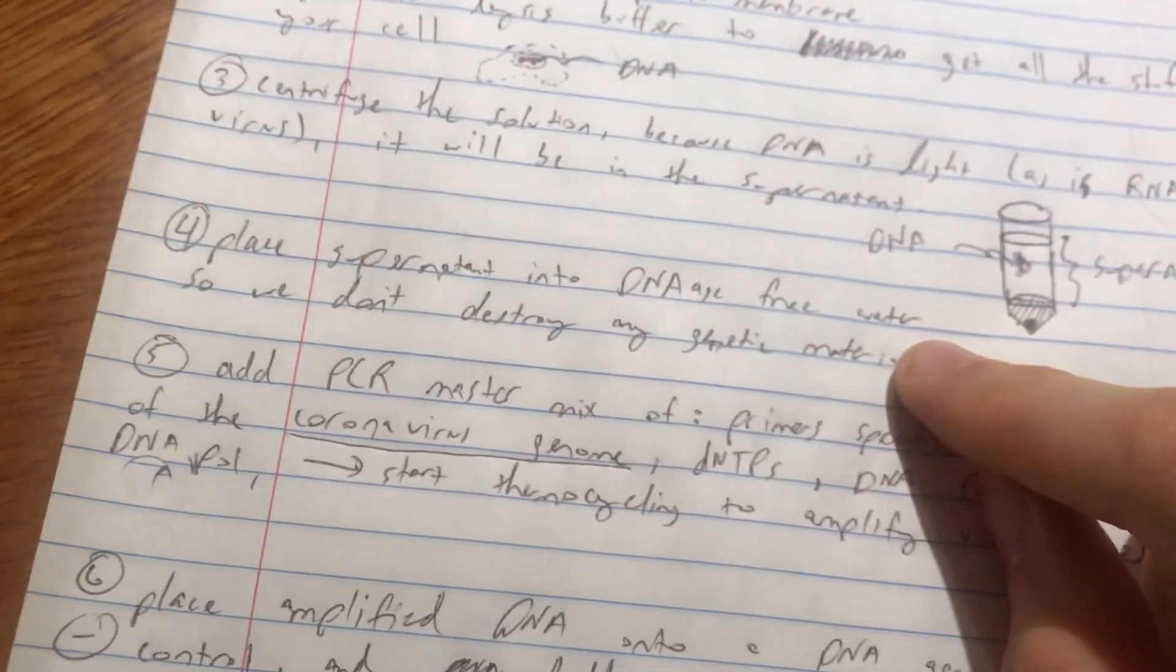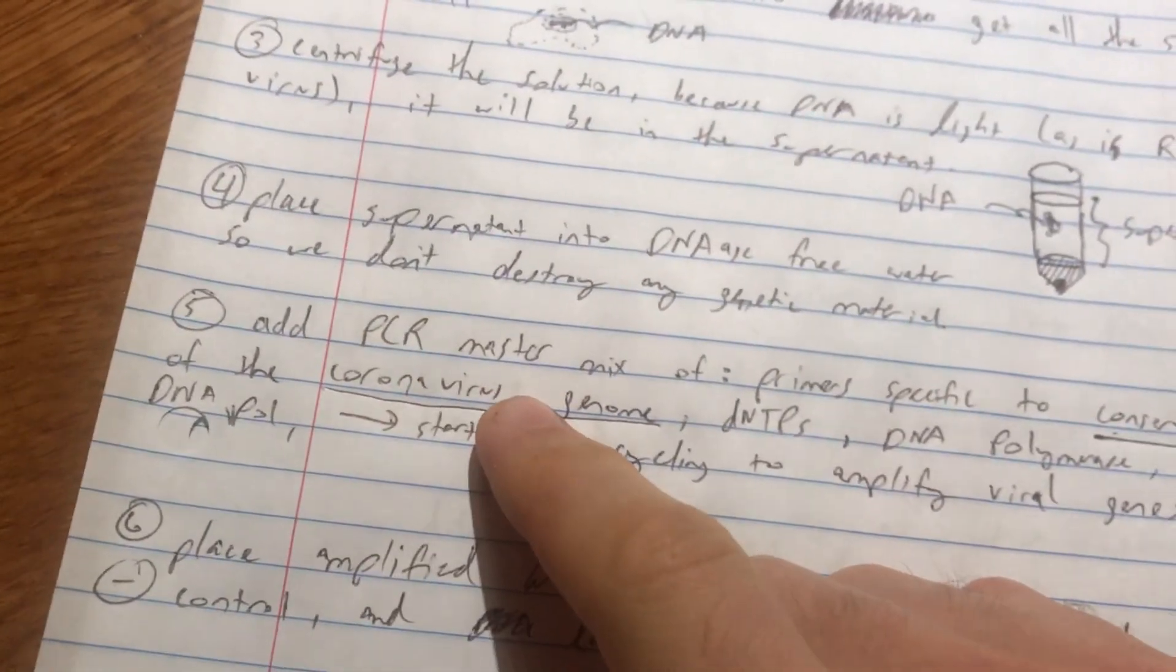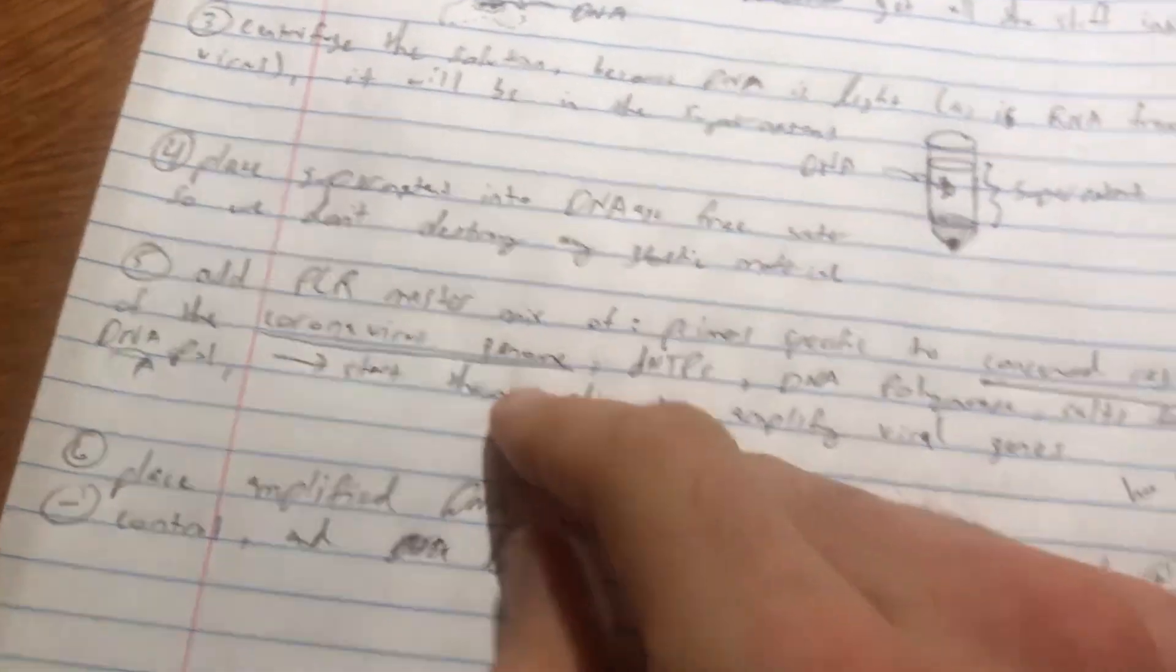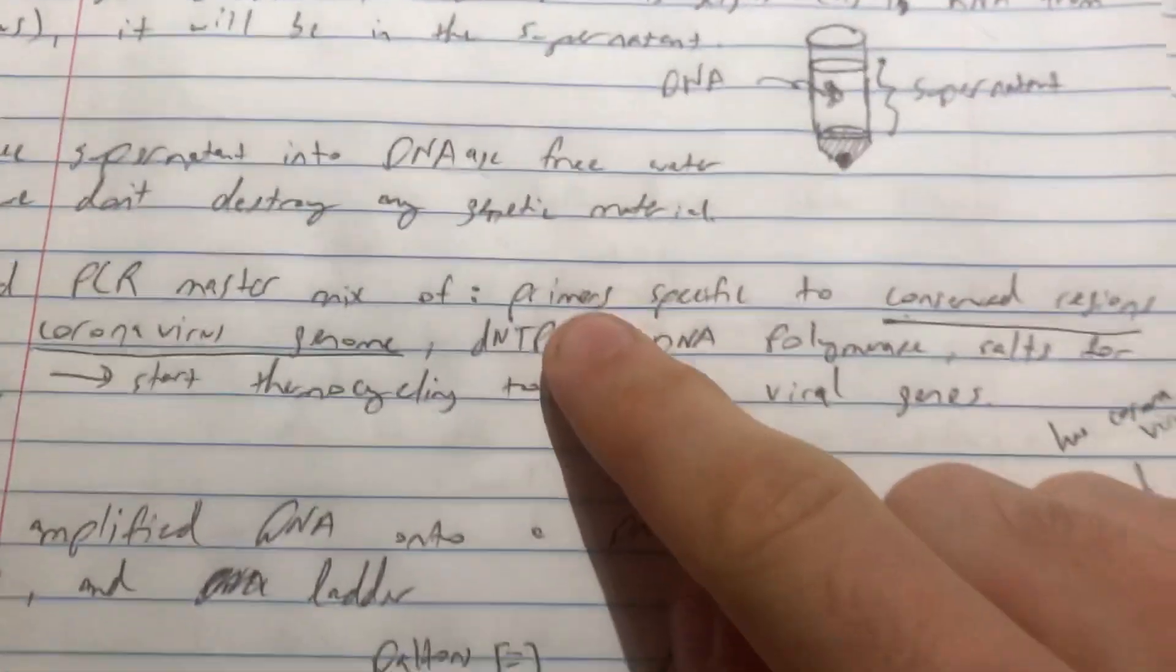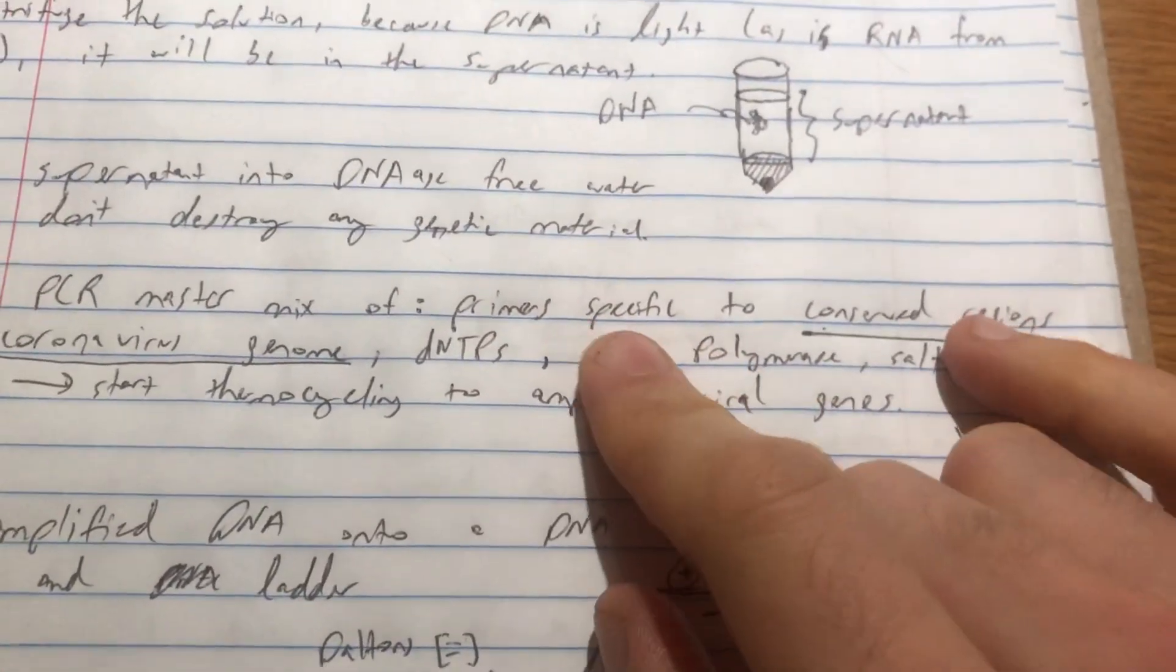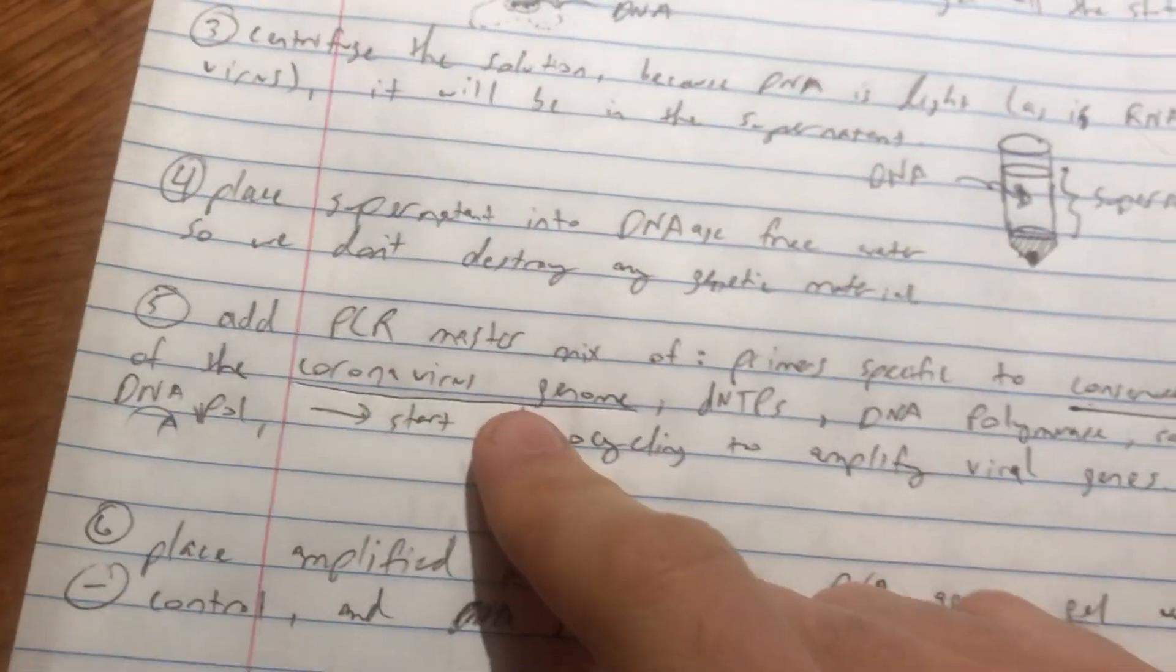So once we've got this solution transferred into good clean water, the next thing we're going to do is add a PCR master mix. And so this PCR master mix, if you remember from biology, is a mixture of primers that will be specific to conserved regions of the coronavirus genome.